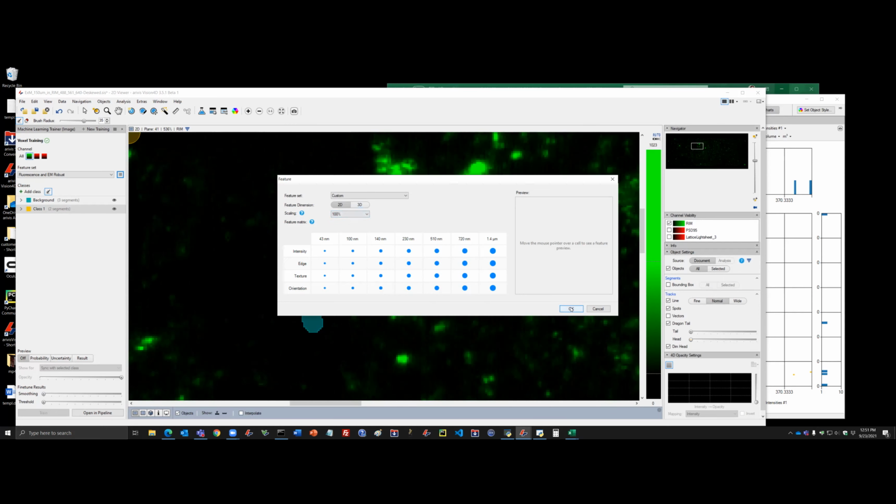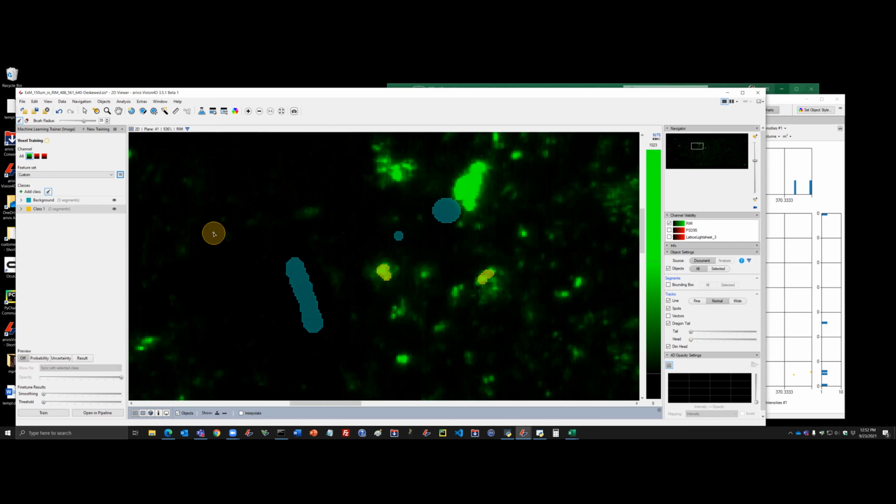Just to add on to that, the actual forest output, which I think you're trying to get at, we don't release at the moment, but that's on the roadmap to be made as an output. Yeah, we just haven't gotten that far in integrating it in the UI. And on the to-do list for the Arivis team regarding the machine learning is also a visualization or output showing which of the features that we're using actually give the most prominent result, so that you can prune the trees and the future algorithms more efficiently.